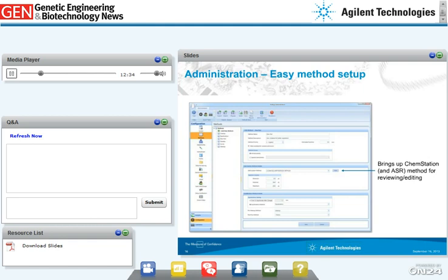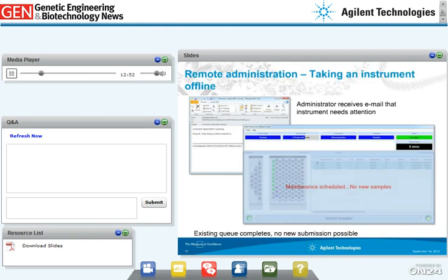This slide shows the simplified method setup interface within MassHunter walk-up software where the administrator can easily set up open access methods, including the ability to review and edit any LC or mass spec methods. If the open access system runs into technical problems, the administrator receives an email indicating the instrument needs attention. The administrator can remotely take the instrument offline, stop new sample submissions, and schedule the necessary maintenance.